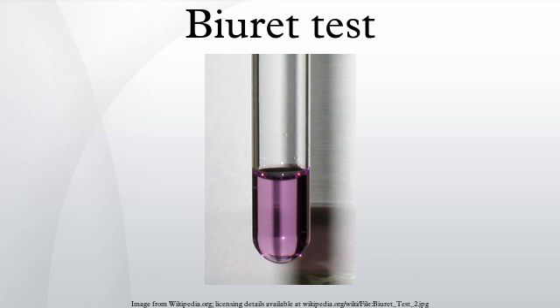This assay is often referred to as the Pierce assay after the manufacturer of a reagent kit. The complex of Cu+ with BCA absorbs around 562 nm, producing the signature violet color. The BCA protein assay increases the sensitivity of the Biuret test by a factor of around 100, and gives the important benefit of compatibility with samples that contain up to 5% surfactants. The water-soluble BCA copper complex absorbs much more strongly than the peptide copper complex.